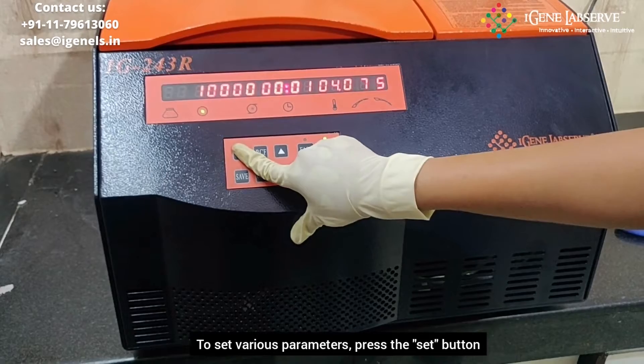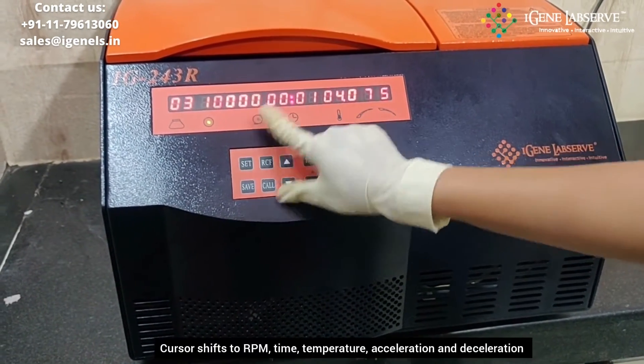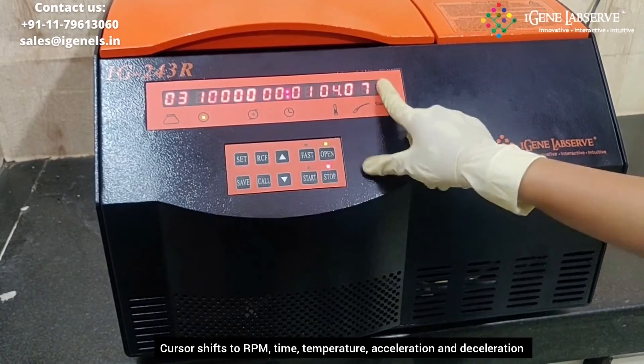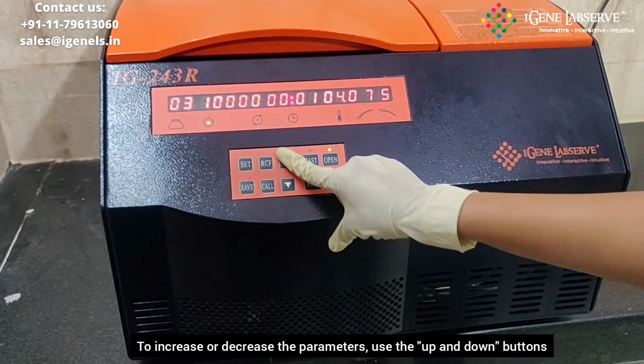To set the various parameters, press the set button. It goes to RPM, then to timer, then to temperature. When you press the set button again it goes to acceleration, and then it goes to deceleration. To increase or decrease the various parameters, you have to use these two arrow keys.